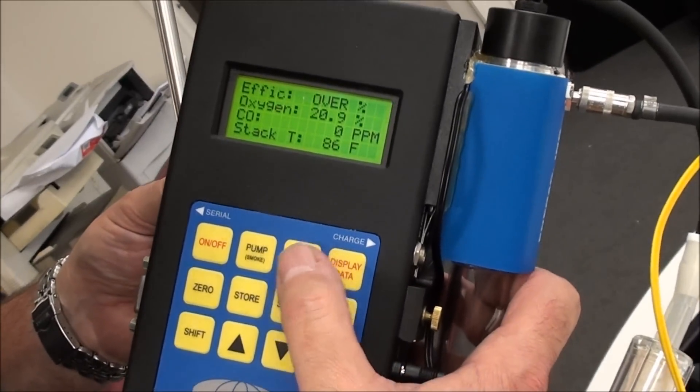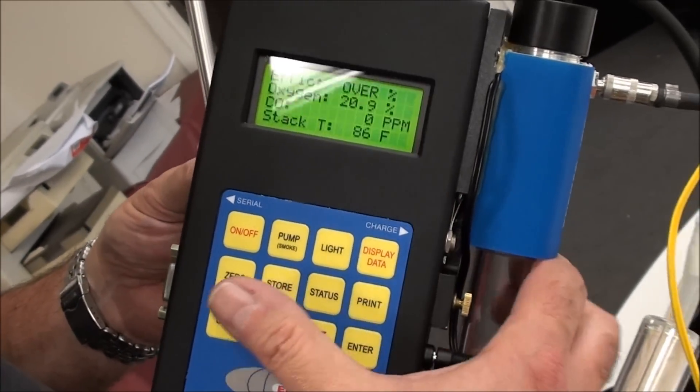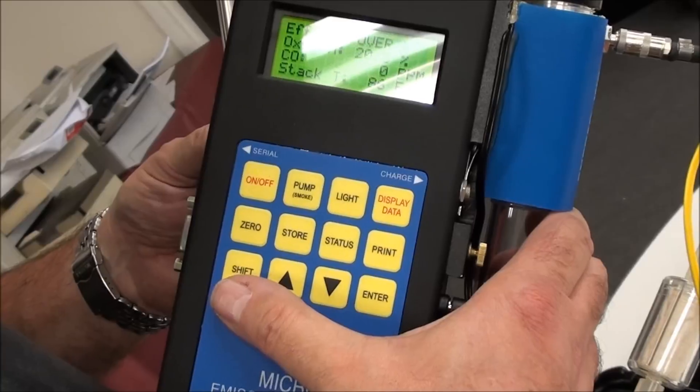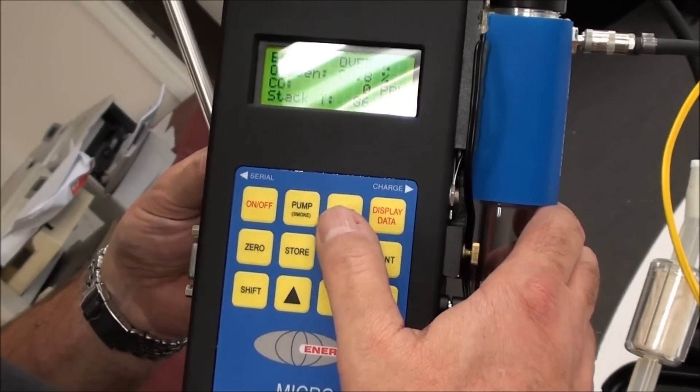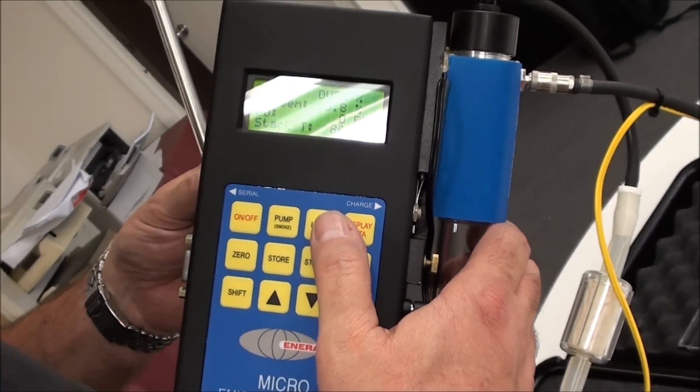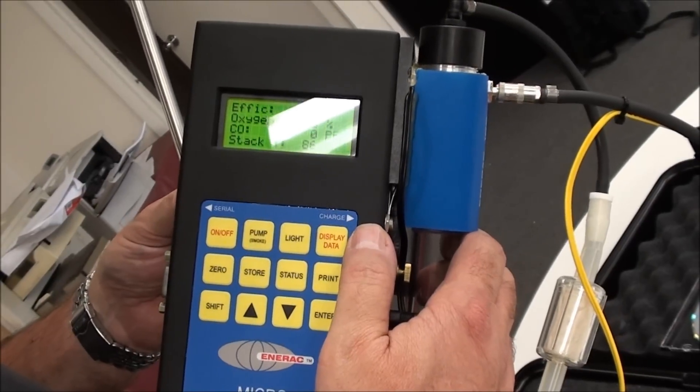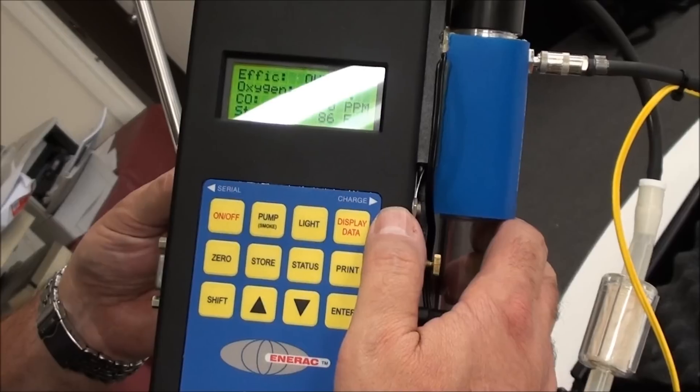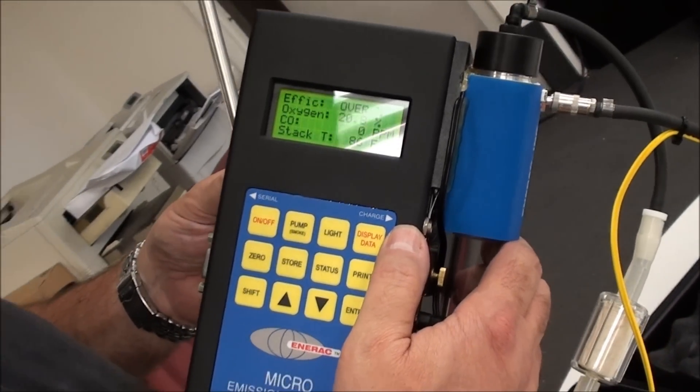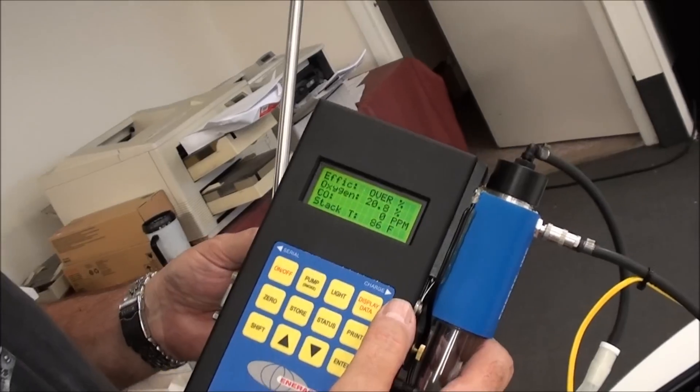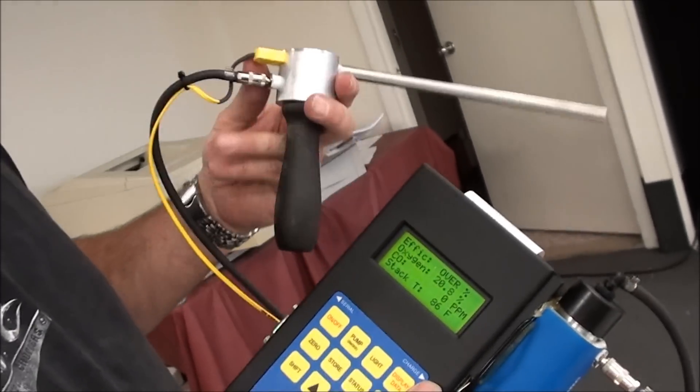Another option is you can set up a timed storage, which you can access through the menus. You could also review, if you want, in the menus. You can review the stored data and erase or print out hard copies from the stored data. So those are the several options that you've got.